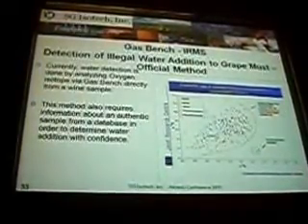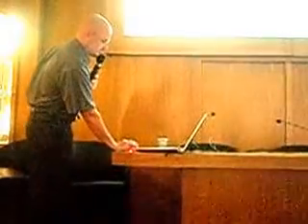So let's say, for example, we take this north red spot, this one. We add water. Because local waters, surface waters, have a more negative delta 18O value, this value will be more negative. But compared to the isotopic profile of that water, it may fall here. It will still be positive, not negative. So we cannot confirm that water is added if we don't compare it to that specific sample from the wine data bank.